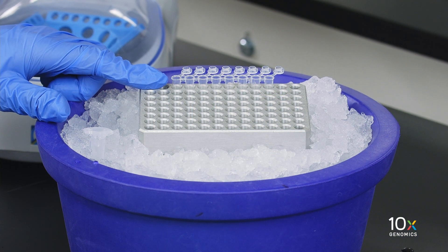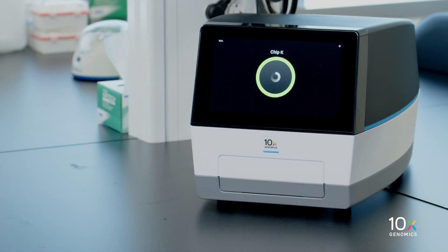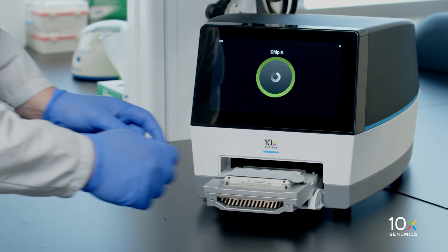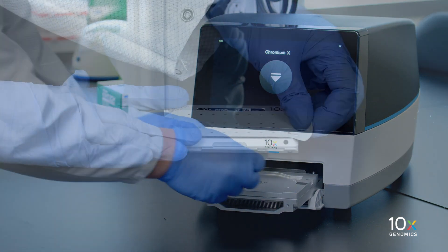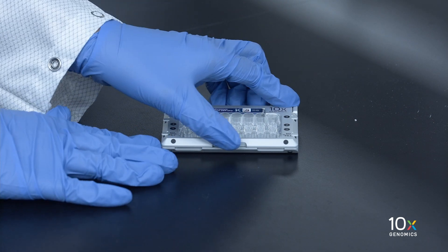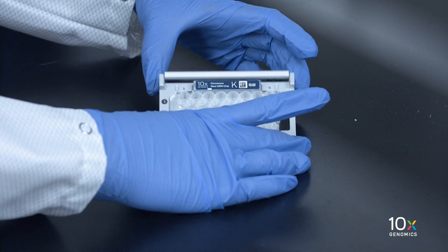First, place a PCR-8 tube strip on ice. Press the eject button and remove the chip. Discard the gasket and open the chip holder. Fold the lid back until it clicks to expose the wells at a 45-degree angle.